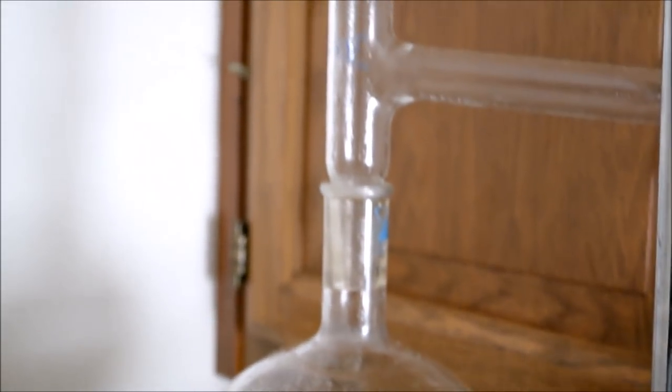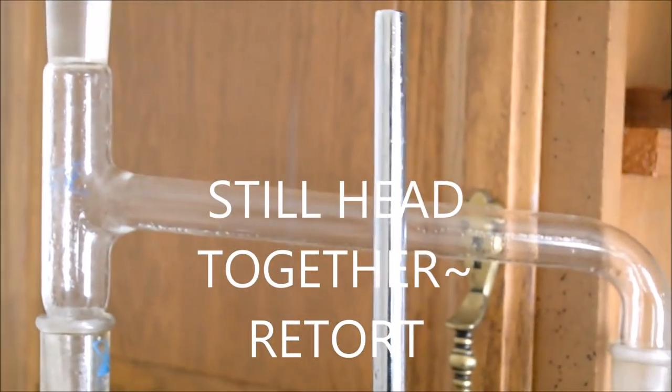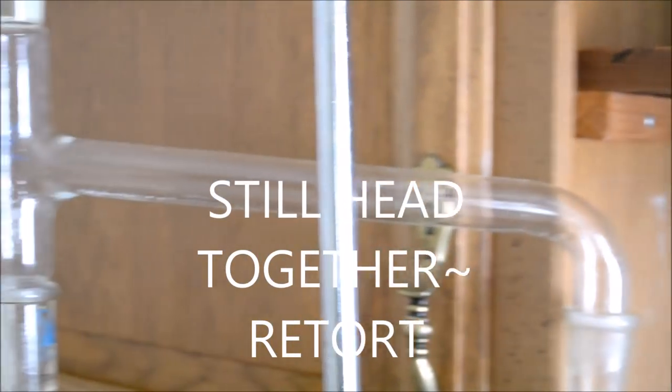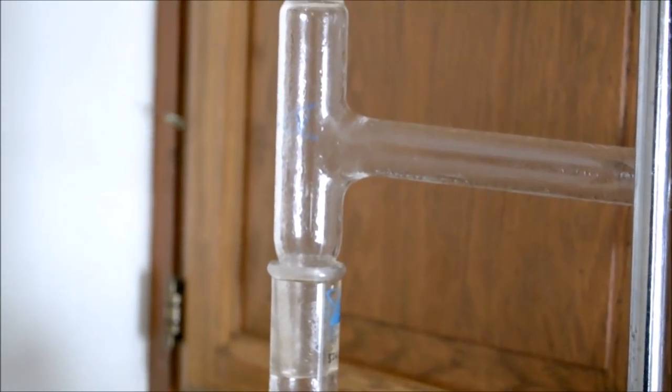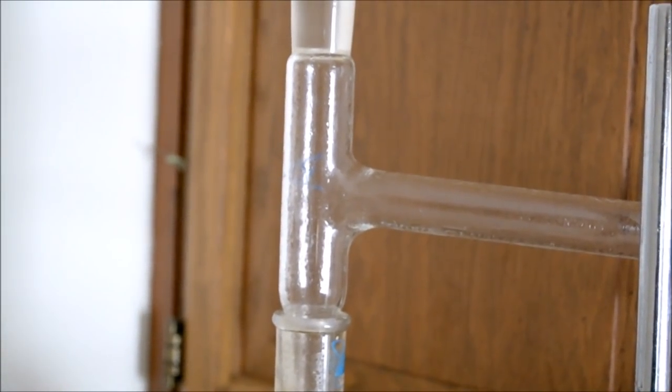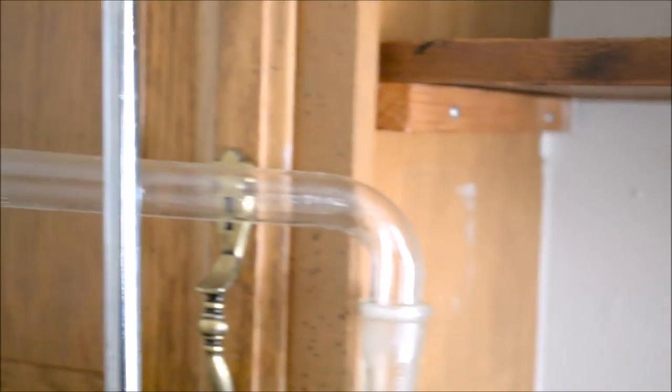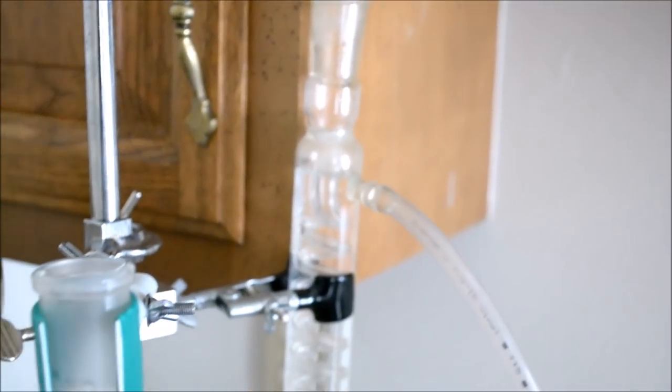Following up the reservoir flask, you come to what's known as the distilling arm or the still head. A couple different names, but essentially this is a key component to connect the reservoir flask to one of the most unique parts of the system: the condenser.